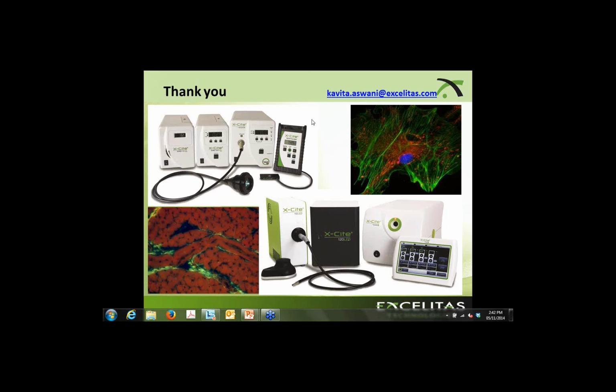What rates are the LEDs pulsed at? Is asked by Claire Brown. Oh, hi, Claire. So in that particular example, if you're talking about the X-LED, you can pulse them at whatever rate you want to. In the particular example that I presented about the live set versus the continuous versus the pulse, that one was at 30 microseconds. You can go as fast as 10 microseconds if you wanted to, but that particular experiment was at 30 microseconds. And like I said, you can define it as you want to within the software.